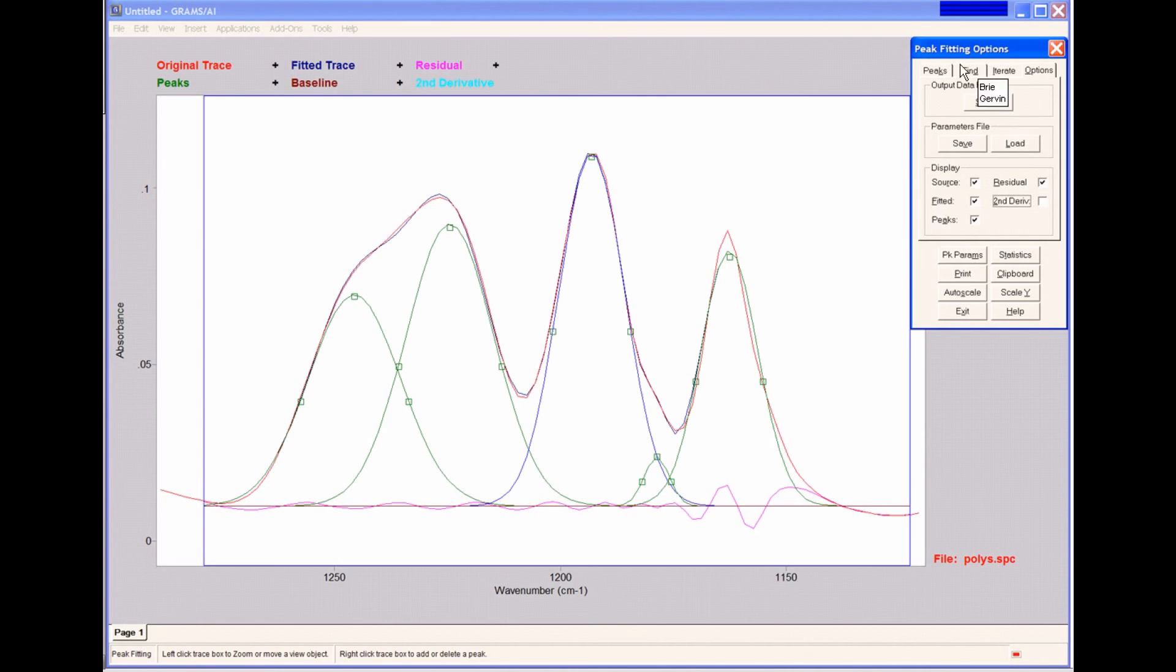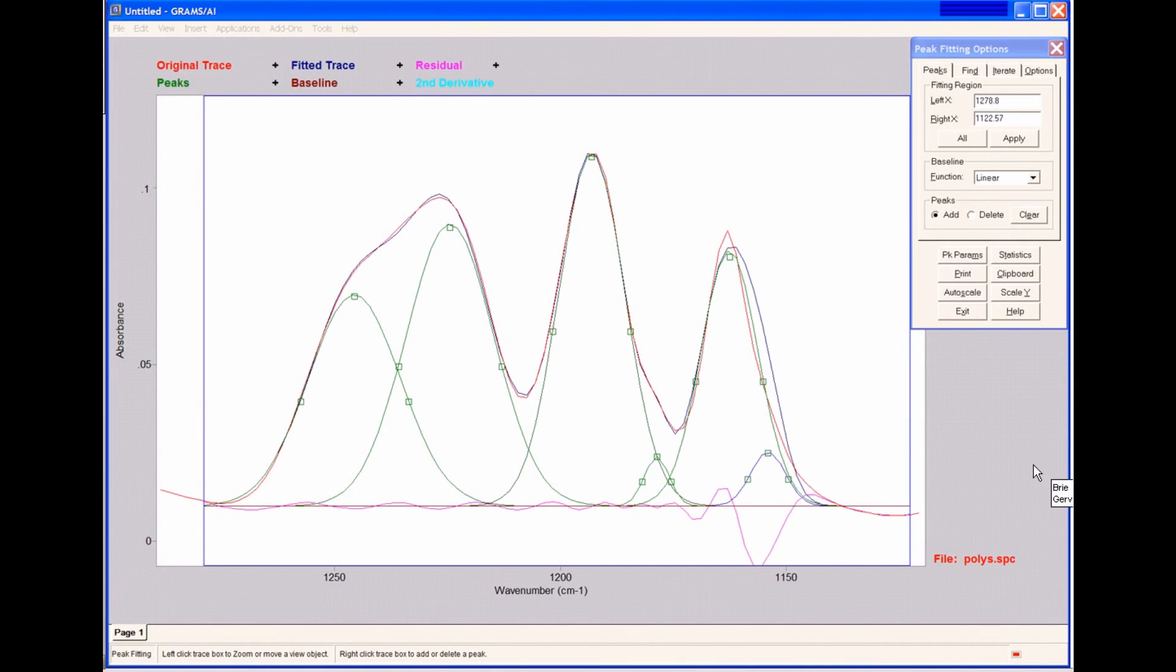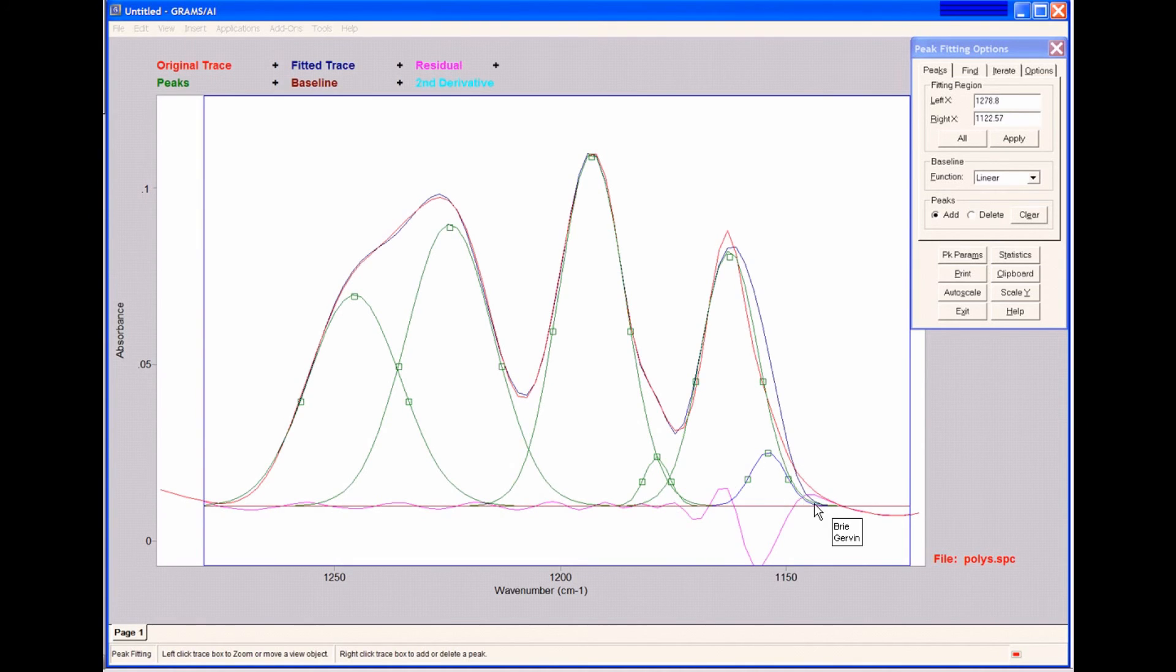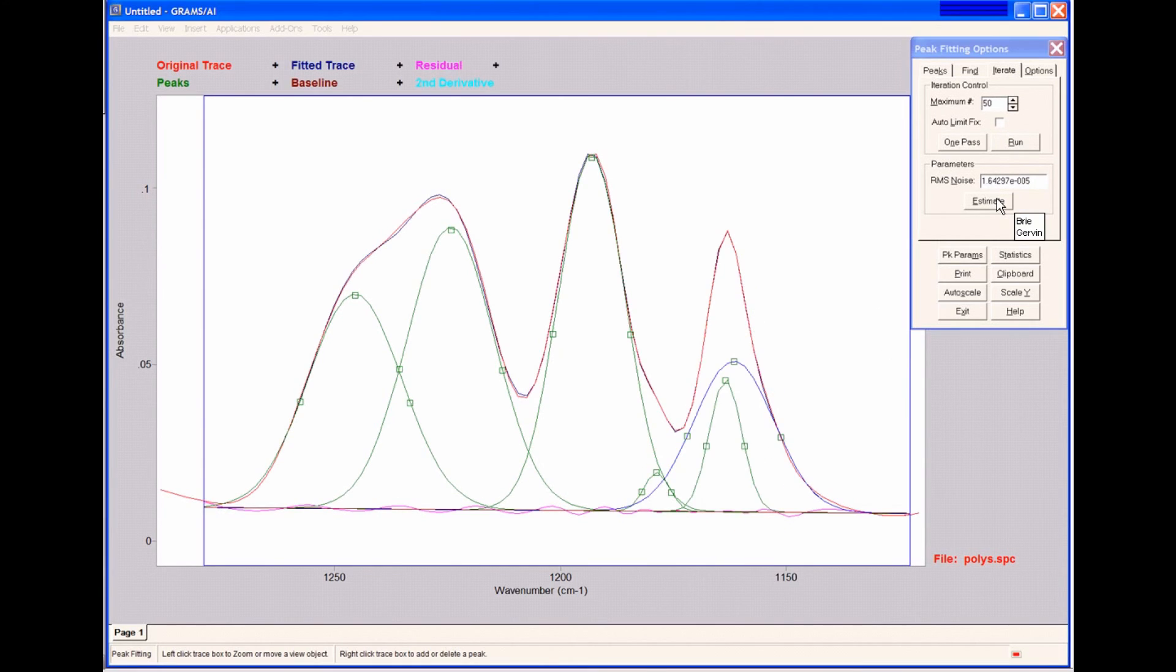And I can very easily decide to add another peak. I simply right-click in the trace box, and that added another peak. I can then choose Iterate again and Run. And as you can see, it does significantly change the results that we had.